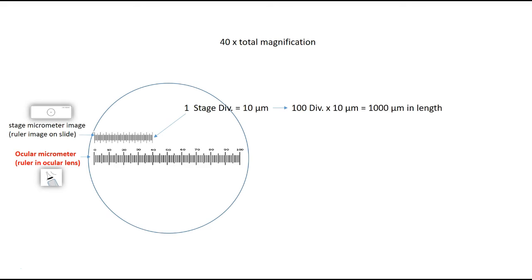If your microscope has other objective lenses — for example, many are equipped with a 100x objective lens — you'll need to go ahead and calibrate your ocular micrometer using those lenses as well. Once you've successfully calibrated for all your objective lenses, you don't have to recalculate these values ever again. The values associated with each objective lens will stay the same unless you change the lenses, so you can use these division lengths to size your specimens each time. This concludes my demonstration on how to use a stage micrometer to calibrate your ocular micrometer. I hope you found this helpful — please feel free to send me any comments below.